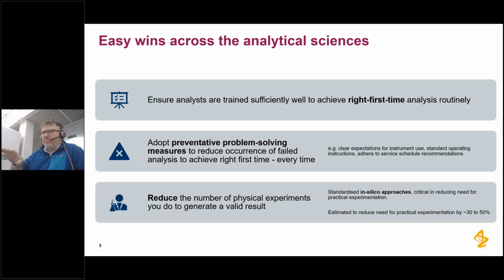And I saw the results from the poll that was just up on the screen initially, and we've done work in-house and shown that by using modelling and simulation as opposed to doing lots and lots of experiments, we can reduce the need for practical experimentation by somewhere in the region of 30 to 50%.